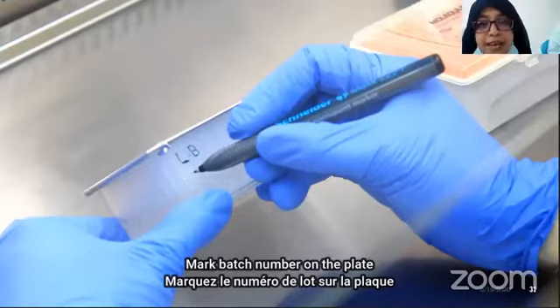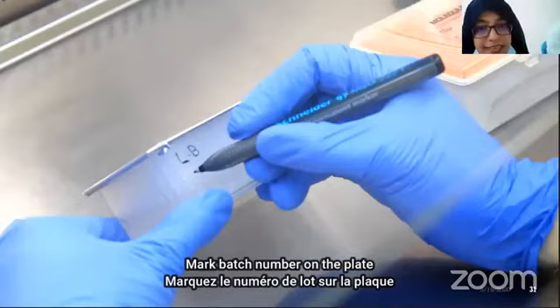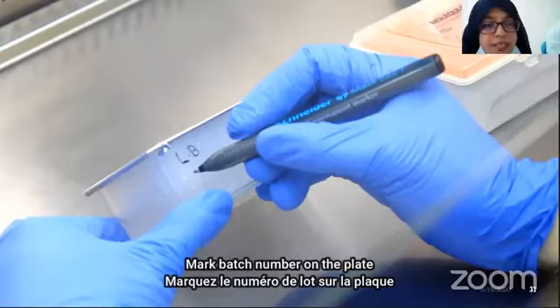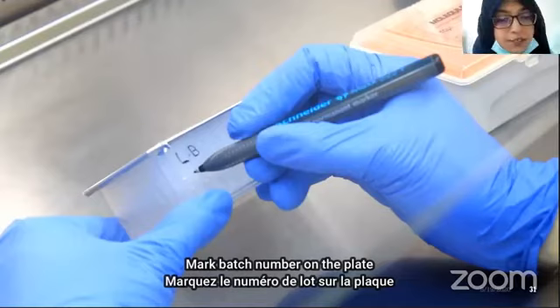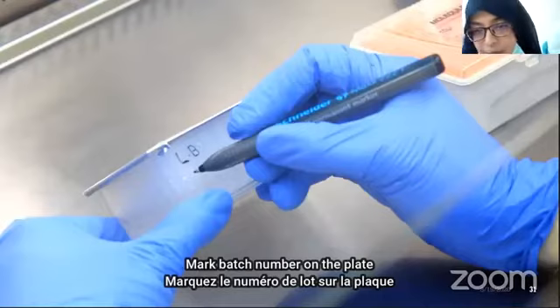So how can we add both positive and negative control together? Negative control is only RNase, DNase free water. So we add the negative control separately and the positive control separately.